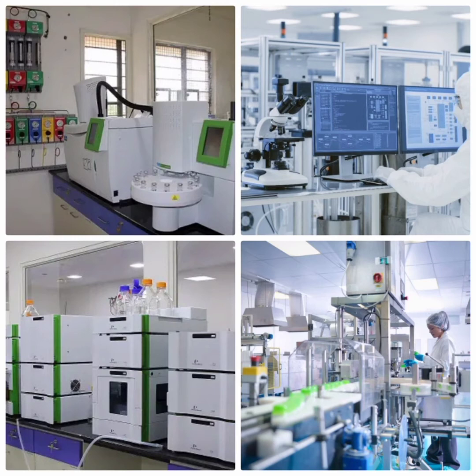Principally, four methods are used for quantitative estimation both in HPLC and GC. Those are normalization of peak areas, internal standard methods, external standard methods, and standard addition methods.